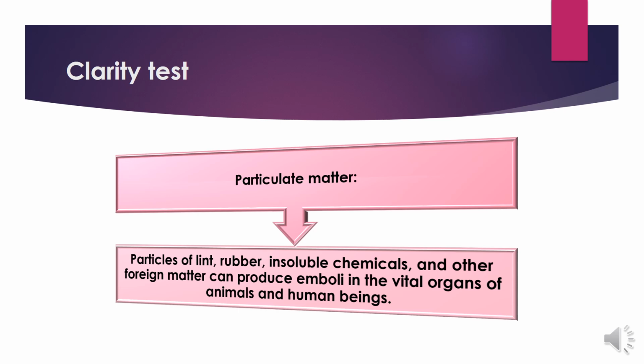If these produce emboli in the vital organs of animals or human beings, that can prove fatal. Therefore, all the parenteral preparations must be free from such particulate matter, whether foreign matter or undissolved active or inactive chemicals. The product must be free from them to prevent formation of emboli in humans and animals.